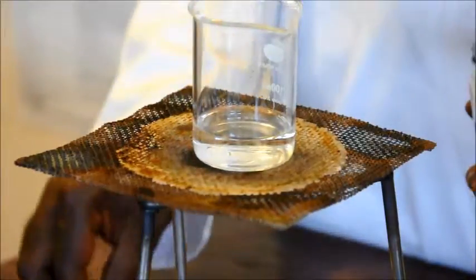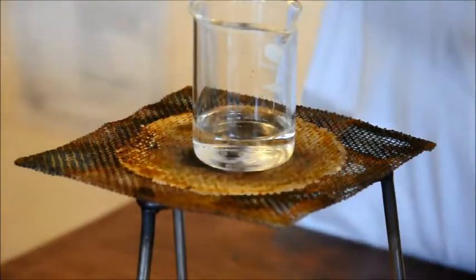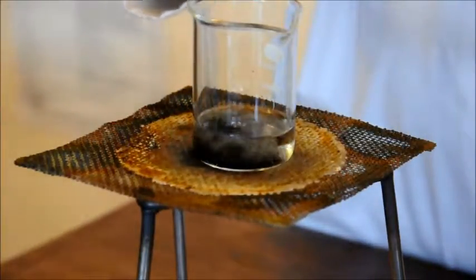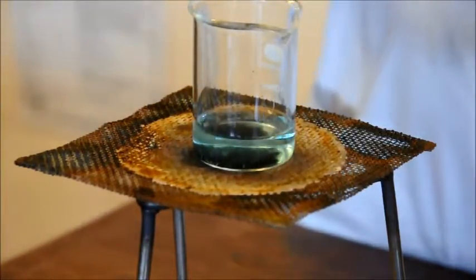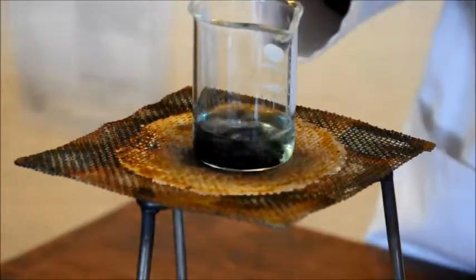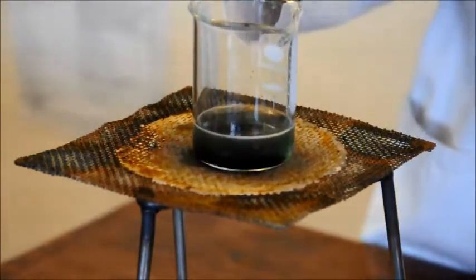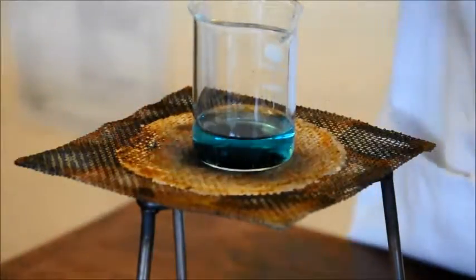Now check for the safety goggles, because there's always a chance that something exciting might happen. Sprinkle a little bit of it in, and you can see it's fizzing. It's reacting. I've got a pale blue solution. That tells me it's reacting, so I'll sprinkle the rest in. The reason why we stop heating is so that it doesn't all boil over.